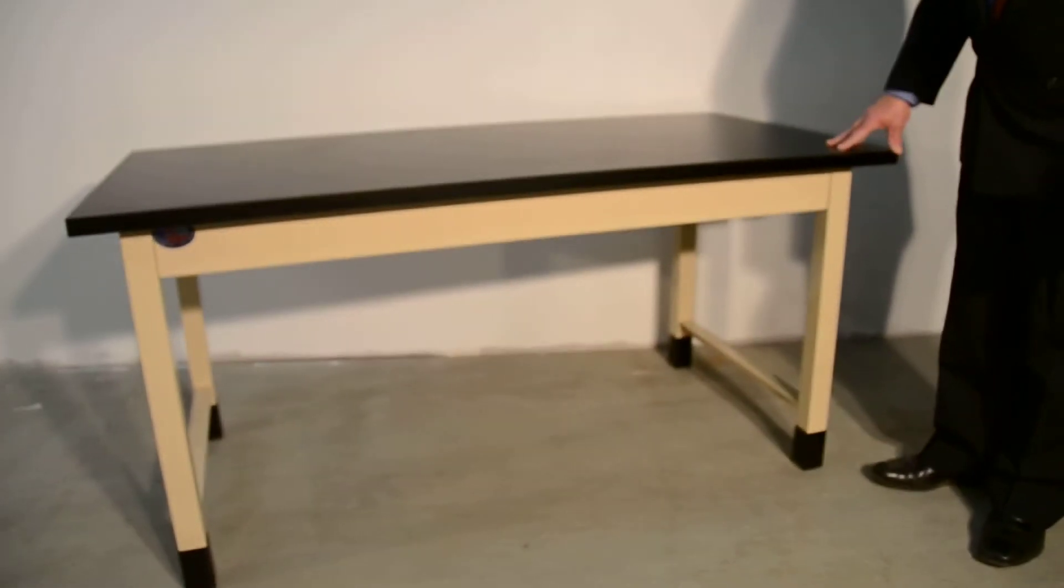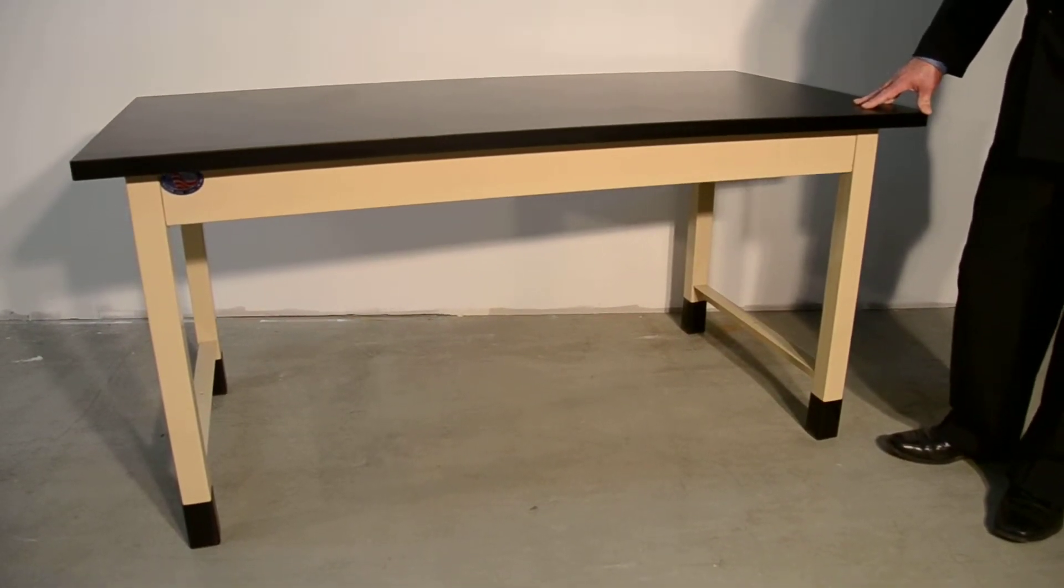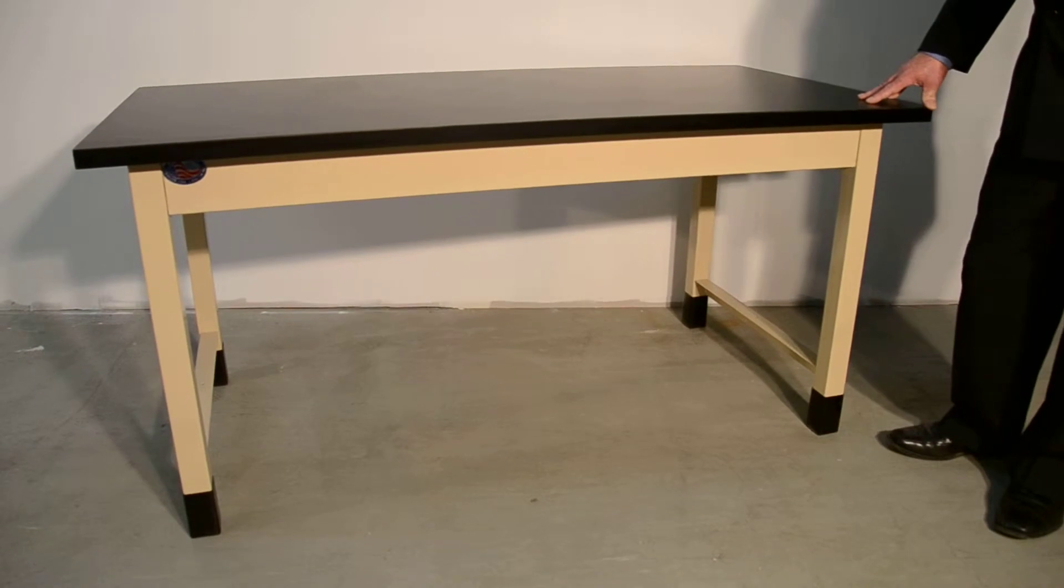This is available in various sizes, 48 inches long by 30 inches deep, up to 72 inches long by 36 inches deep.